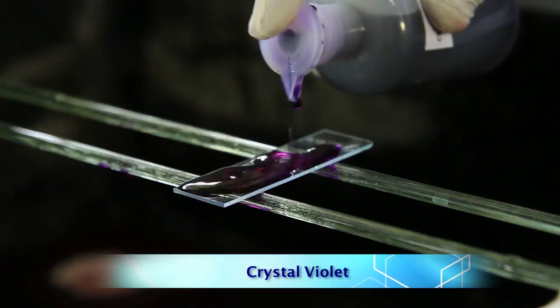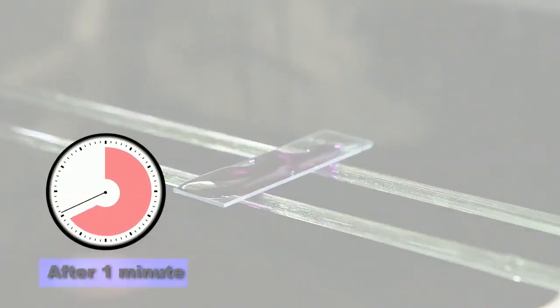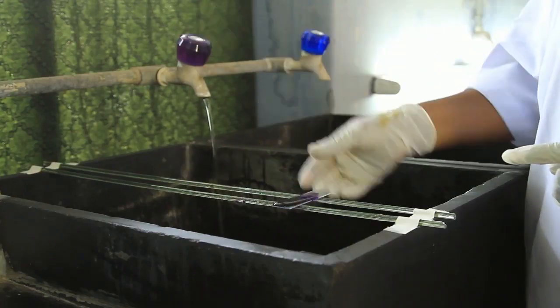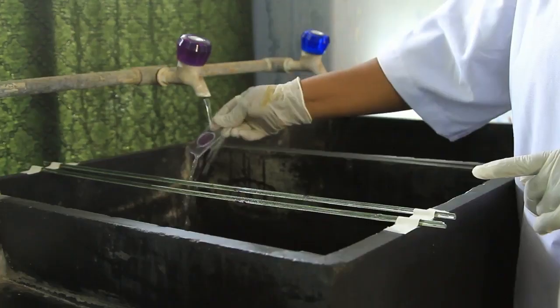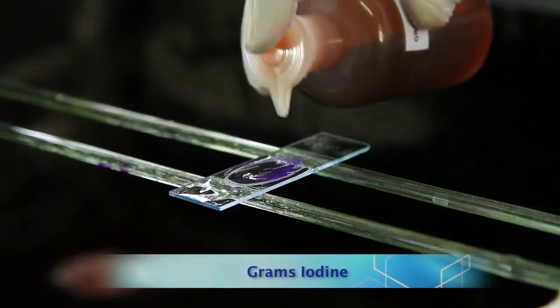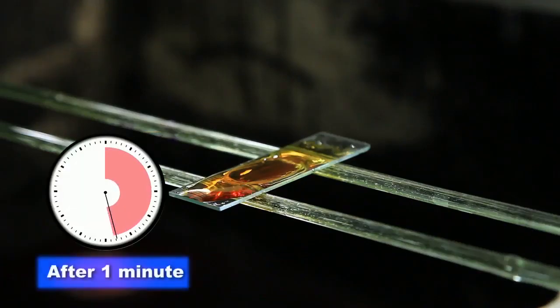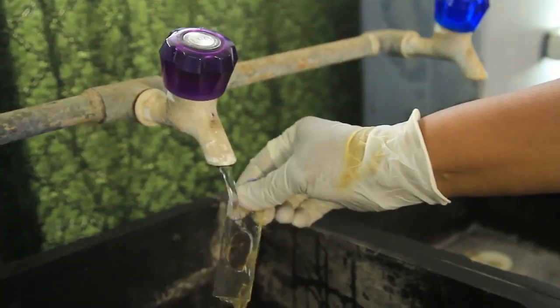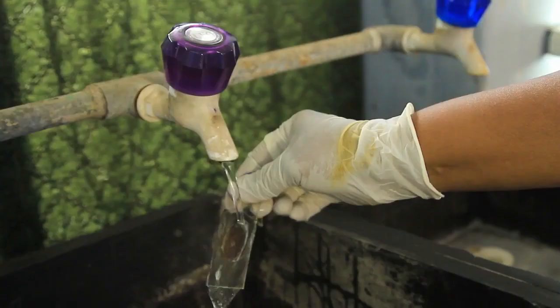Gently flood smear with crystal violet and let it stand for 1 minute. Tilt the slide slightly and rinse with a gentle stream of tap water. Gently flood the smear with Gram's iodine and let it stand for 1 minute. Rinse with a gentle stream of tap water. The smear will appear as a purple circle on the slide.